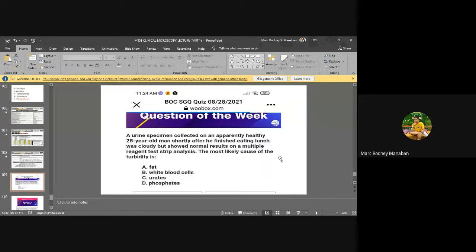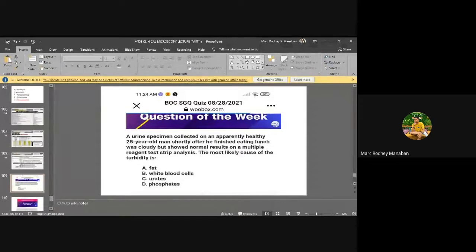Okay. What is your answer? WBCs, okay. Alright. So there are other answers. WBC only. Urates, okay. Alright, so there are other answers. Anyone who will answer differently?